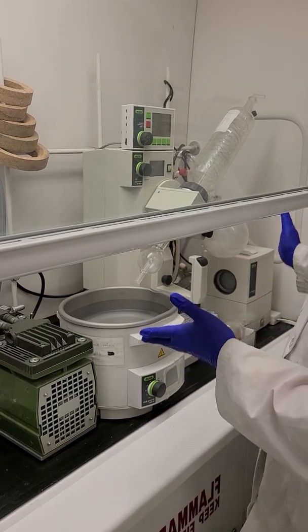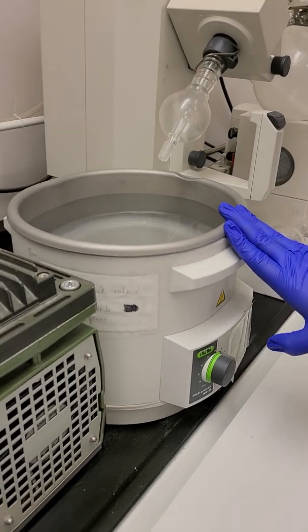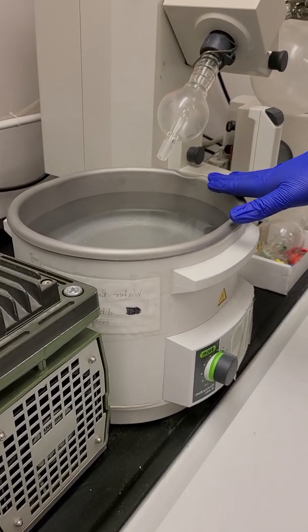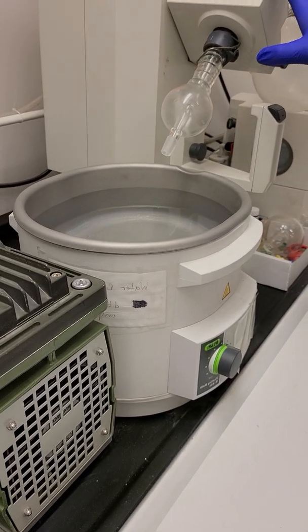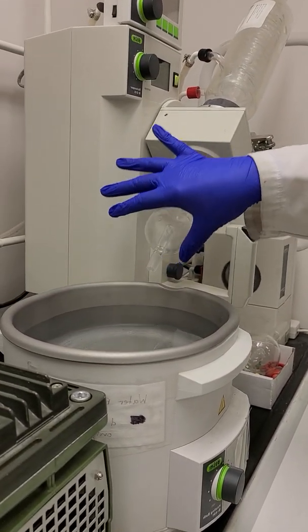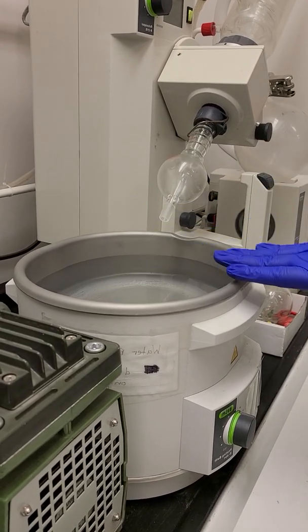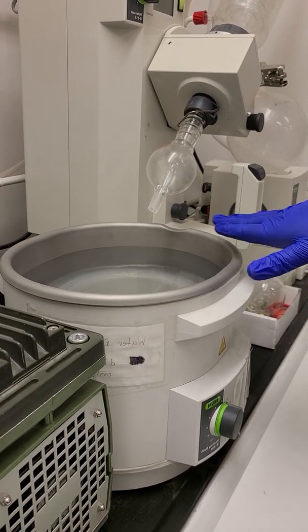Let's talk about the Rotovap. The first thing you need to do is make sure that the water bath is filled. As you can see, it needs to be filled enough so that when you lower the connection with the round bottom flask, it can completely submerge your flask. So it has to be filled roughly to this level here.